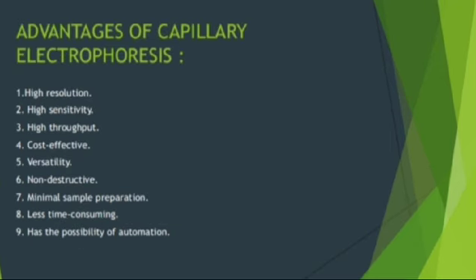Advantages of capillary electrophoresis: high resolution, high sensitivity, high throughput, cost effective, versatility, non-destructive, minimal sample preparation, less time consuming, has the possibility of automation.